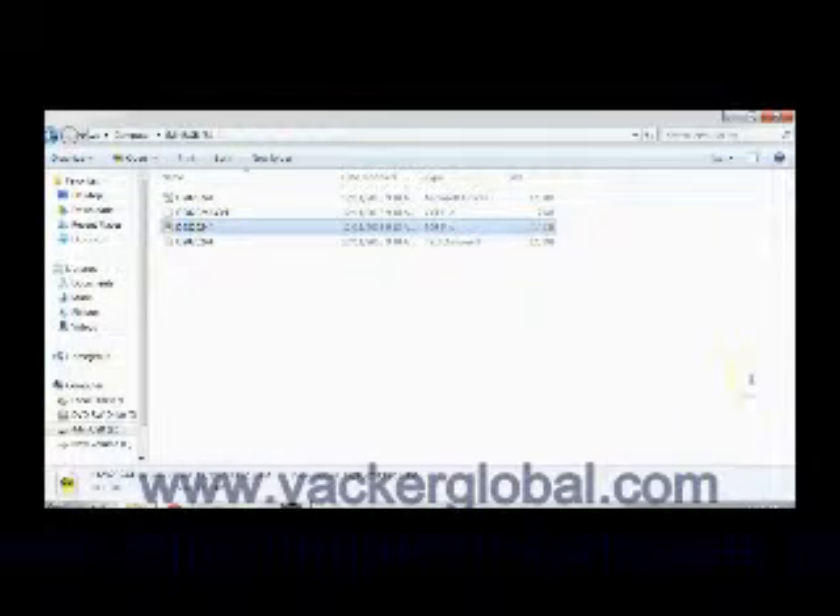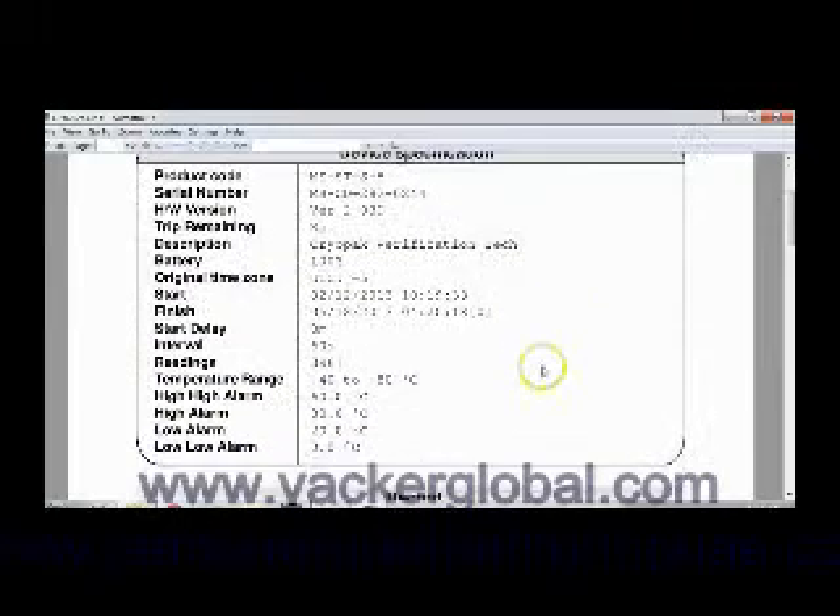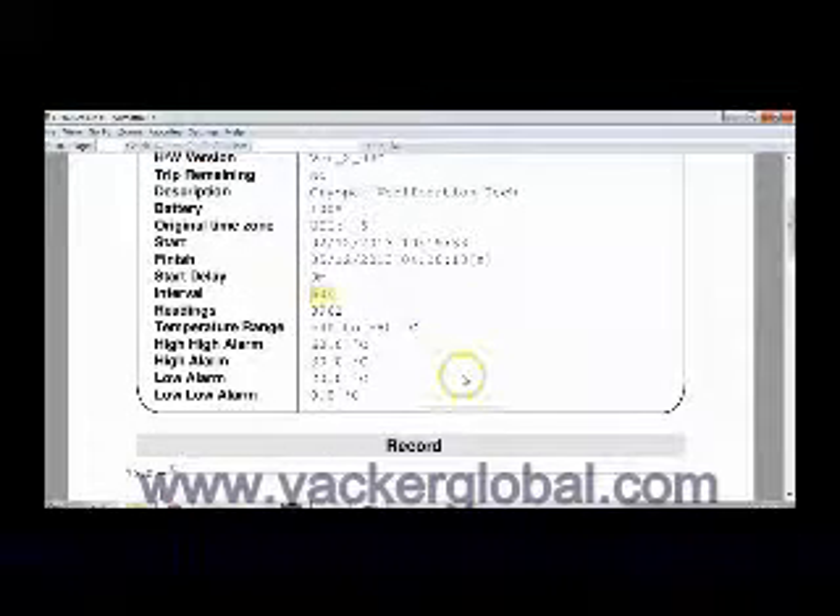First we will open the PDF report. You can see the report here. The sampling rate is 60 seconds. Further you can see the number of readings, two levels of higher limits and two levels of lower limits.